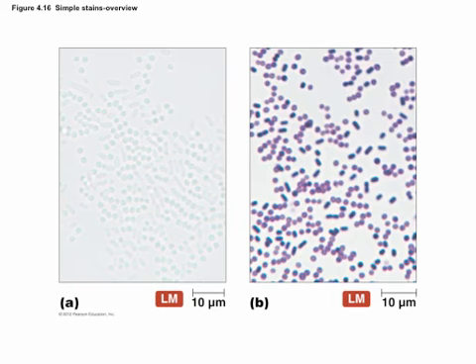But you have nice light pink cells that don't take the purple dye. Or actually, they do take the purple dye, but it washes out. If there's one thing that you should all come out of lab knowing how to do, it's a Gram stain. Make sure you know it.